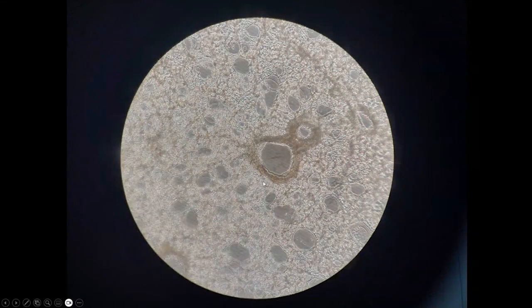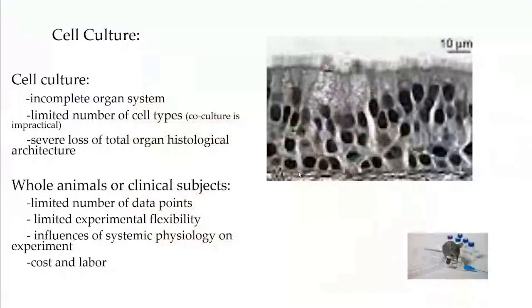Now here we have a picture of a slice, and you'll see how the slice smooth muscle ring is typically associated with a blood vessel that runs alongside of it. And again, you see parenchyma and some air spaces here. But this is typically how the slice will look, and what we are interested in is the smooth muscle ring, because that is a functional part of physiology that exists within the slice.